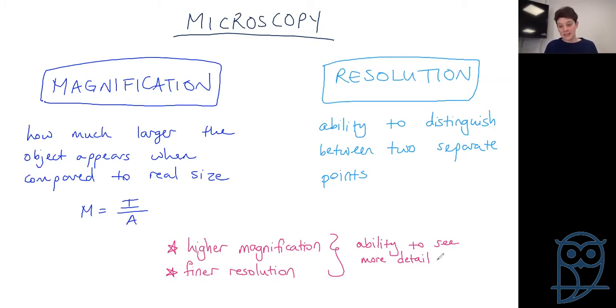So obviously when we take a look at it, magnification, okay, now I understand. It's just getting it bigger. So resolution is the one that I've really got to get my teeth into, because this is telling me the difference between the light and the electron microscope. What was the point of the electron microscope? It's actually that resolution. So let's talk a little bit about how resolution works.